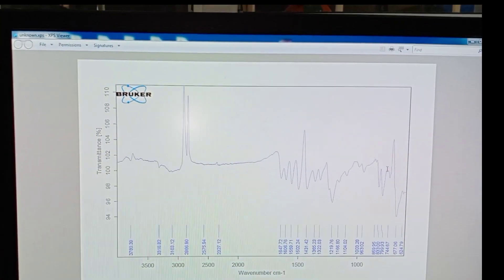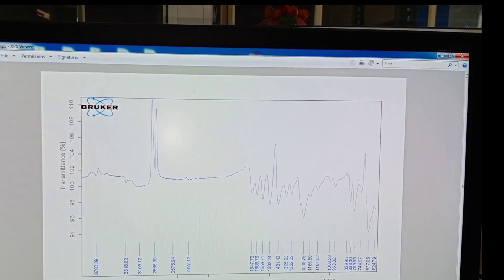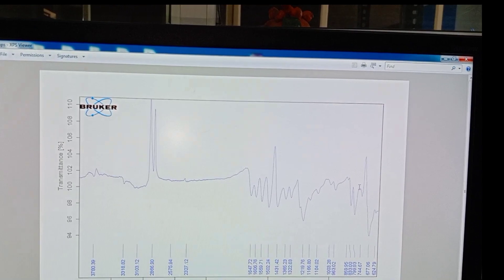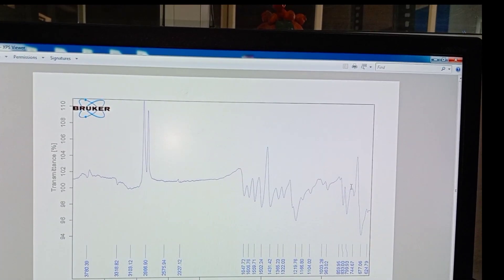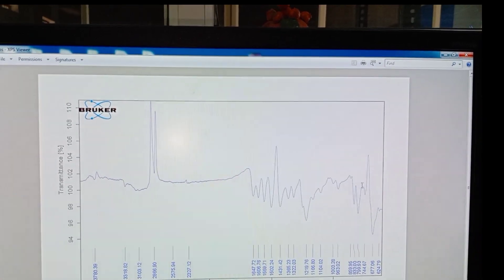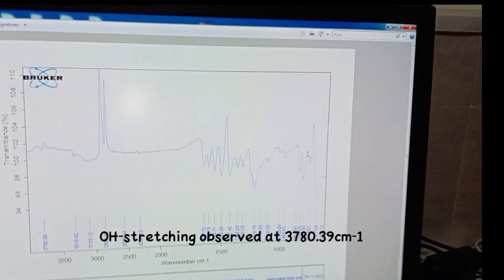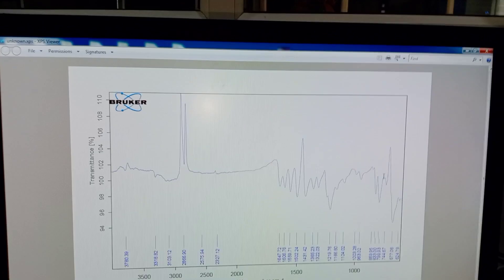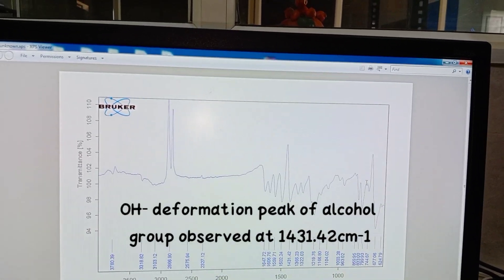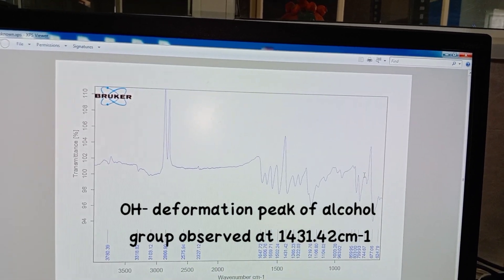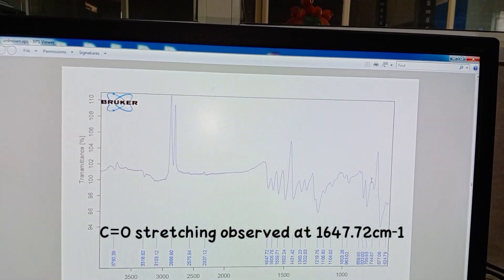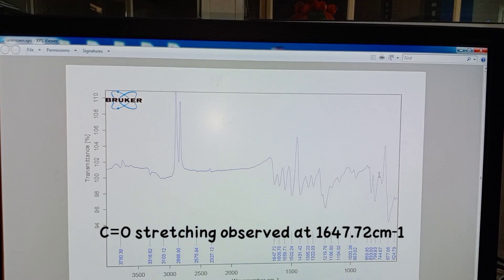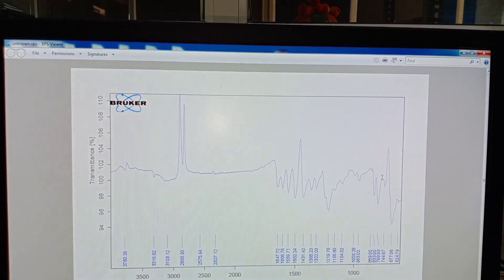Now we have to do the interpretation of the IR spectrum. In the interpretation of the IR spectrum of the sample spectra taken here, we can see the OH stretching observed at 3780.39 cm inverse, and OH deformation peak of alcohol group observed at 1431.42 cm inverse. Next, C double bond O stretching is observed at 1647.72 cm inverse, which indicates the presence of an amide group.